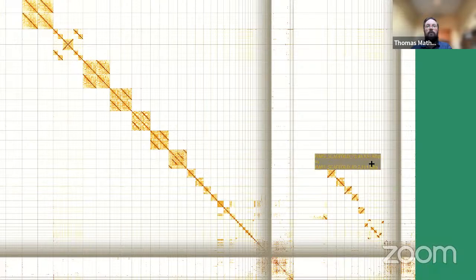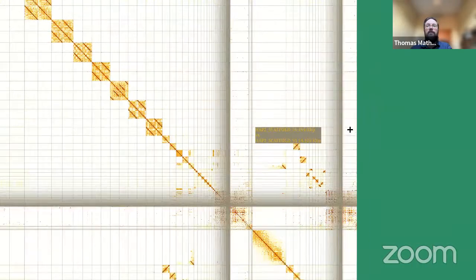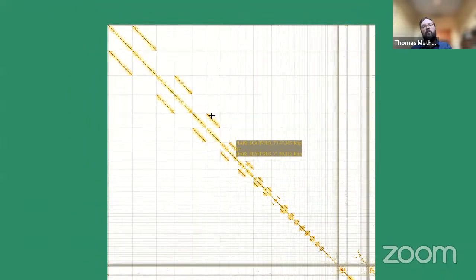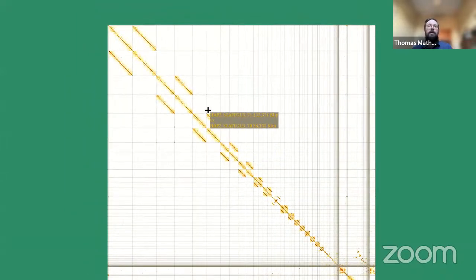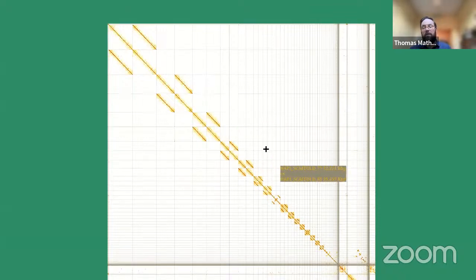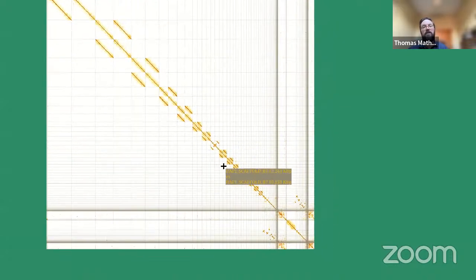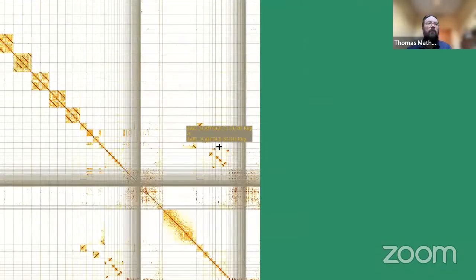Like this. So this is basically just matching up the two haplotypes of the assembly. And for this bird species, we often look for karyotype information for the birds that we curate, so we have a rough idea of how many chromosomes we're expecting. We don't have a karyotype for the exact species, but we know that close relatives have 39 to 40 chromosomes. So that's the number we're aiming for, roughly, but we'll see what we can see in the Hi-C data.